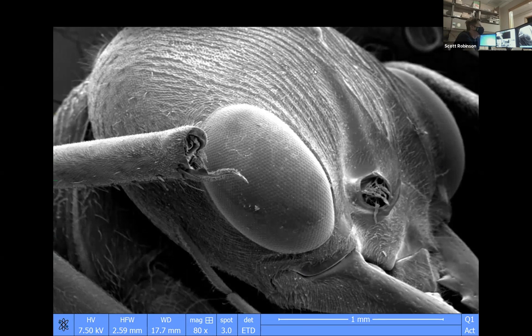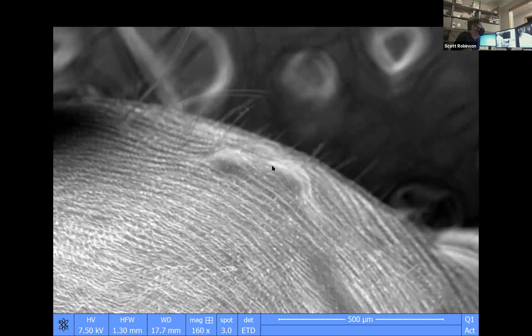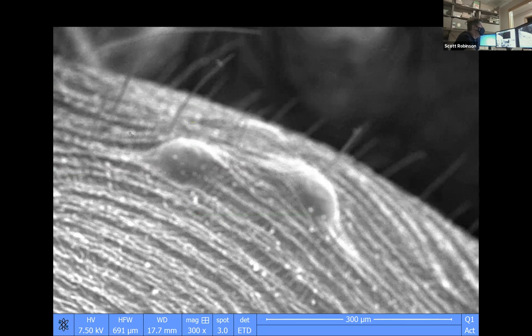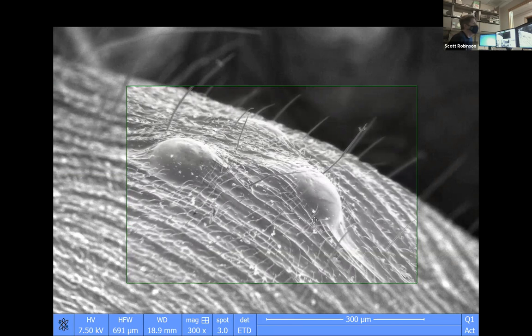And then we can see also many insects like wasps and bees and ants have other eyes on the top of their head. And those eyes are called ocelli. They're also called simple eyes. They probably don't let you see very well, but they help you with your orientation to the sun and the light. So there are actually three ocelli. You can see two of the ocelli bumps pretty well, and then the third one is in the back. It's a little bit hard to see. And then you can see these little sensory cilia sticking out of the top of the head.